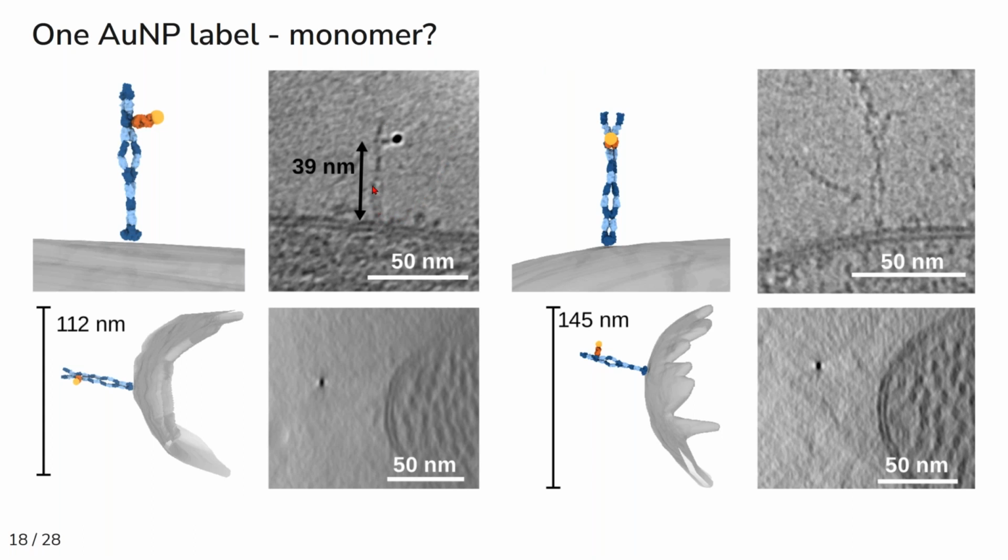So here the density looks definitely like there are two chains of protocadherin-15 in this molecule, and just one of them is bound with a gold nanoparticle. And here again is an example where the gold nanoparticle is kind of in line with the electron beam, so you cannot really see it in the XY slices, but you also again can see two strands indicating that it's in fact a protocadherin-15 dimer that's probably only bound with one copy of the labeling reagent.